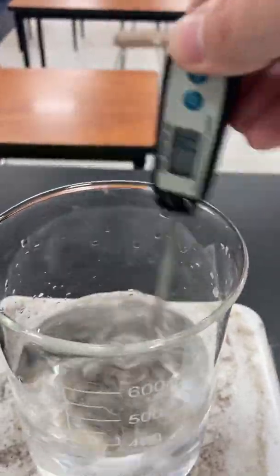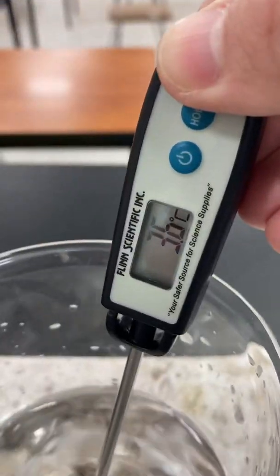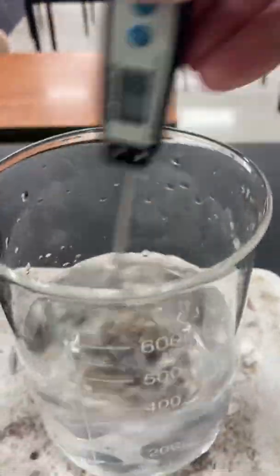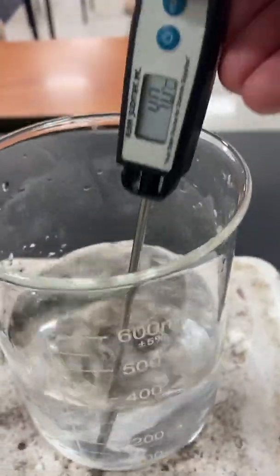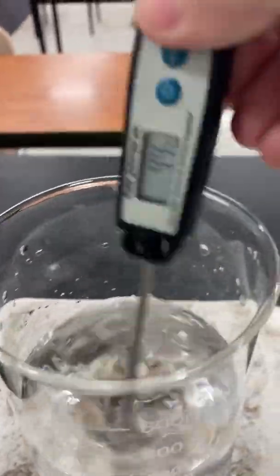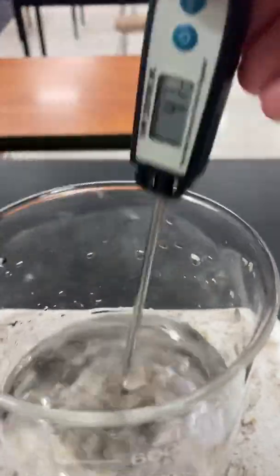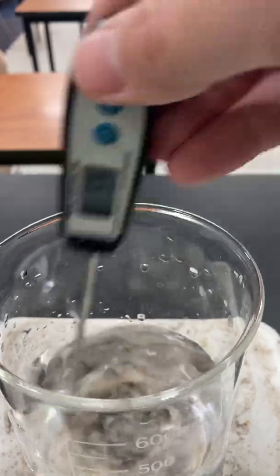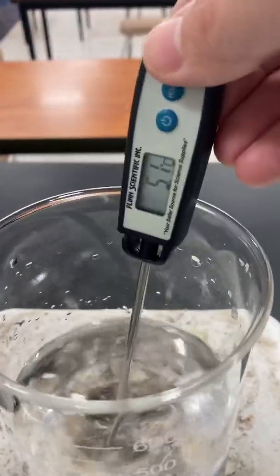Okay, I'm almost at 2 minutes and 30 seconds. Okay, so 3.6 degrees Celsius we had. Still barely changing, only by a matter of like a degree almost. This is almost freezing water still, everyone, inside of this beaker. How can that be when it's on a hot plate? Huh. Think about energy transfer now. Where is all the energy from the hot plate going? What is the verb you would associate with that?